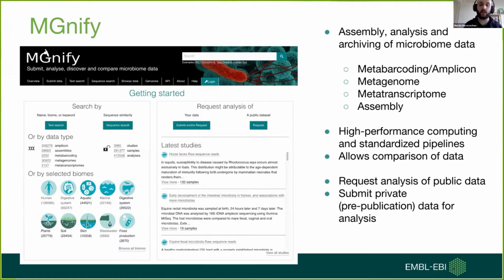We have our own set of standardized high performance pipelines to analyze data that people may submit to us. We usually take public data sets, analyze that information, and then make it publicly available for the community. So it's more like a resource. If anyone is interested in having their metagenomic data analyzed, they can send us the data and we can analyze that for them.